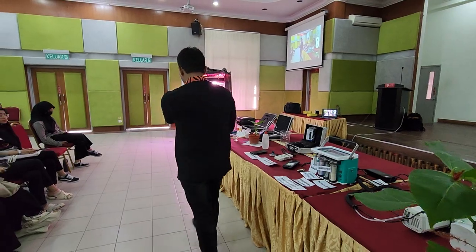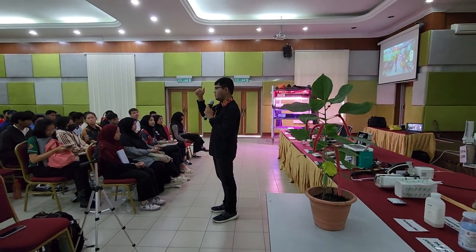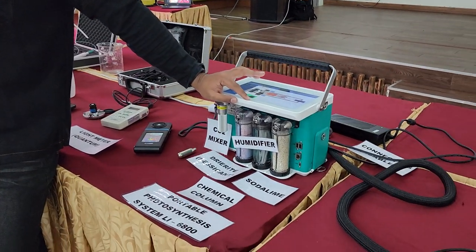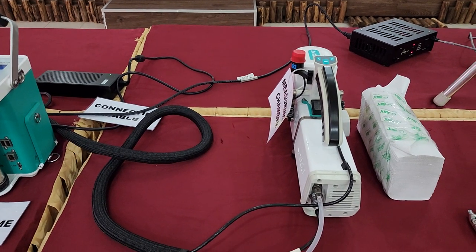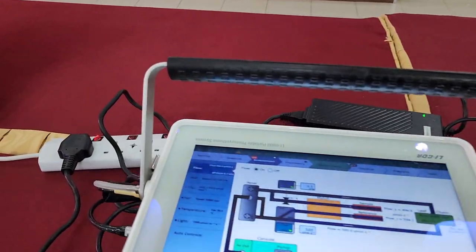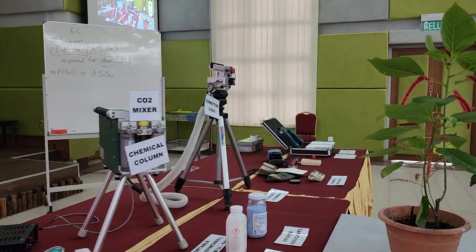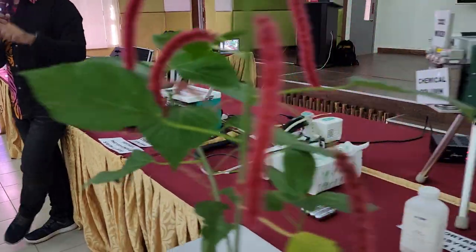So you have learned about many equipments to measure the surrounding of the plants. The soil, the water, the gas, and also the light. Now here comes the equipment. After you have played around with all these abiotic factors, water, gas, and light, what happens to the plant in terms of photosynthesis? Have you learned photosynthesis? Okay, so this machine here, we've got two generations. This is the old generation, LI-6400, since about 25 years ago. And we have the new generation here, LI-6800. Of course, new generation, touch screen and so on, because you like to touch glasses so much, right? So they turn it into touch screen.